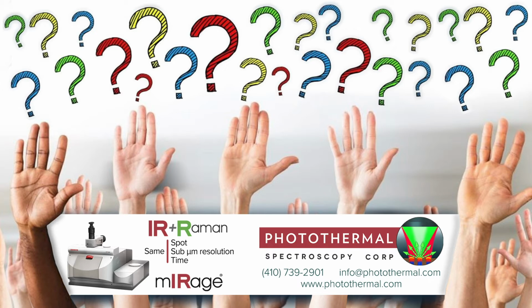Okay. So if there are things in there that are going to give you resonance Raman, the Raman is just like any other Raman process. It's just like doing conventional Raman spectroscopy. You're putting a green laser in and you're measuring the scattered Raman photons. So if there are things that give you an enhanced Raman spectrum, it should jump out at you.